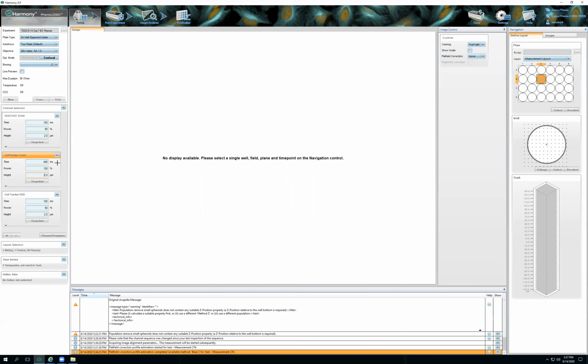You kind of just pick numbers and see how they look. My red was really weak here. This is also based on what I know of my samples, but just pick a random number. If 100 is way too low, then increase it by a lot. Increase your laser power. There's a balance between time and laser power, and again, help will give you more information.